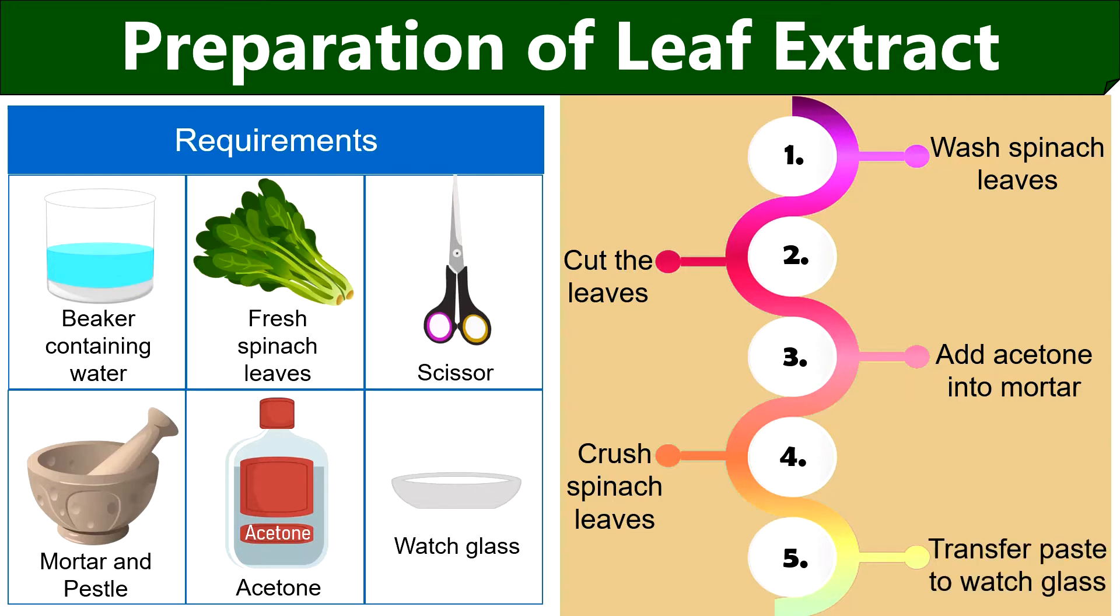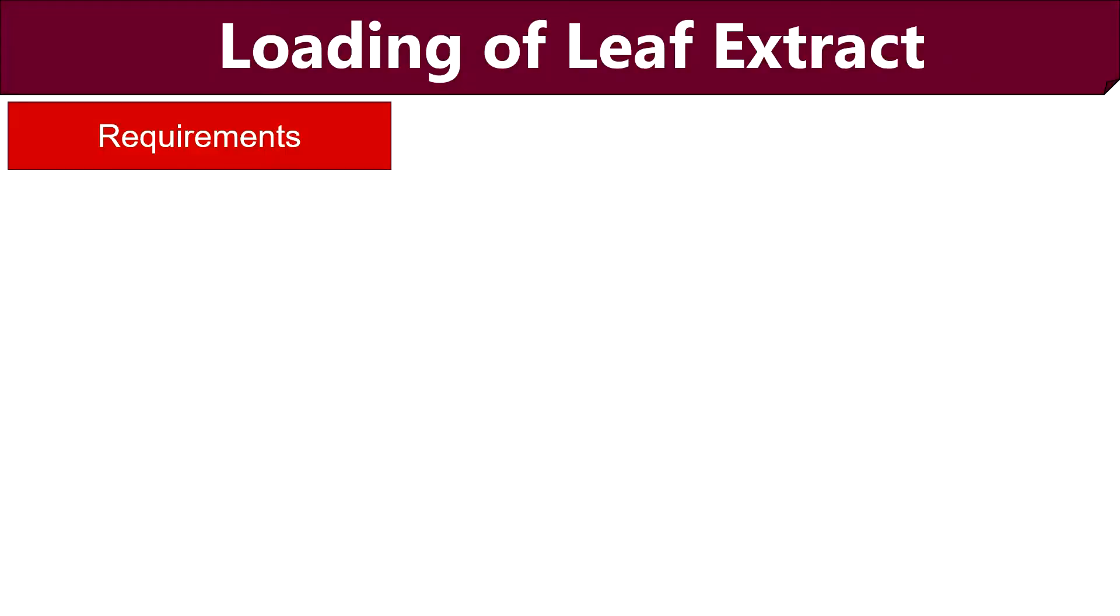At last, take out the mixture into the watch glass. Then in the next step, we have to load the concentrated leaf extract onto the absorbent paper.